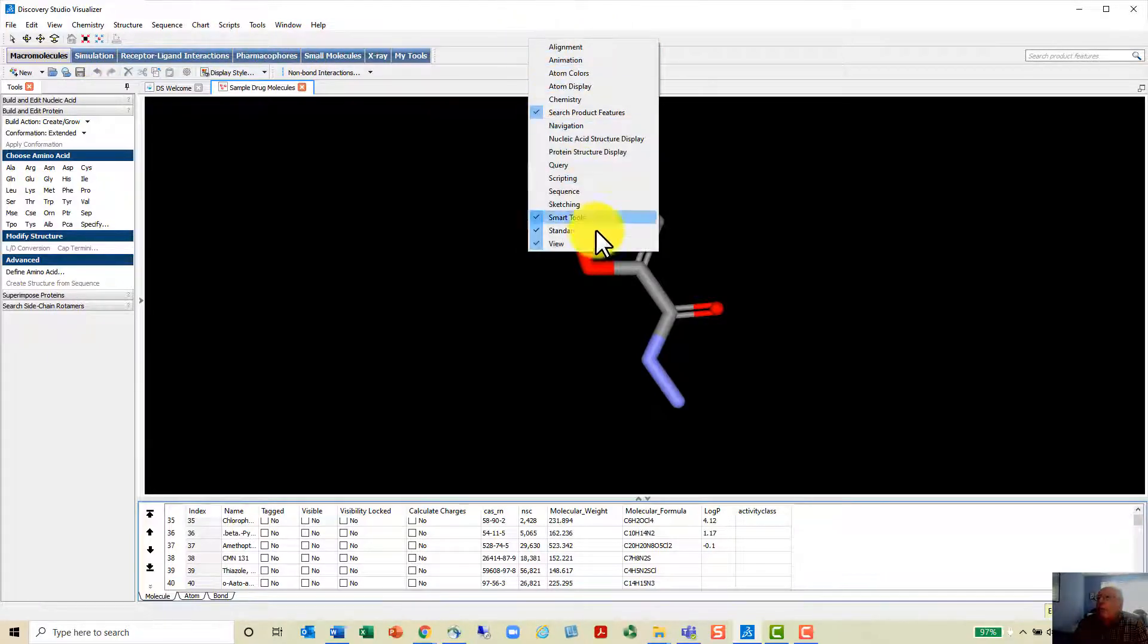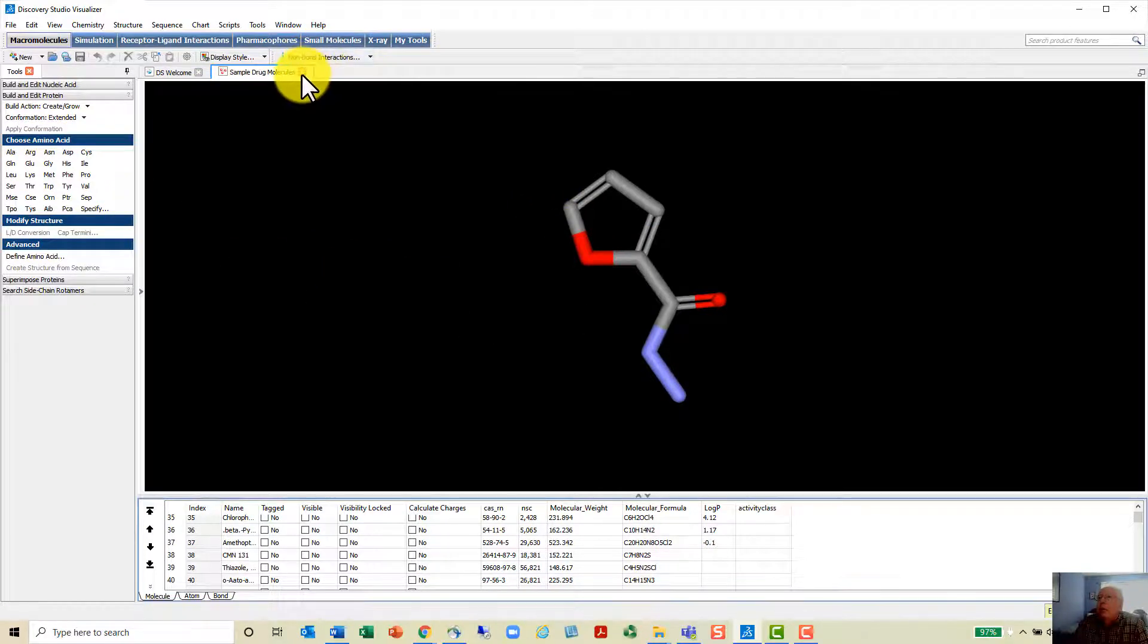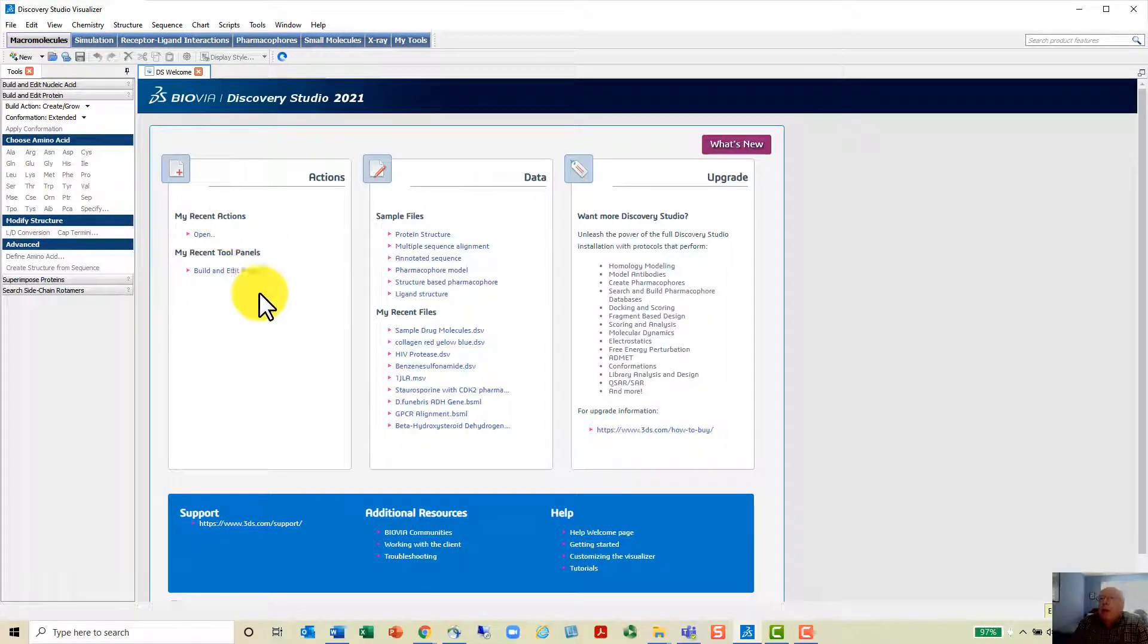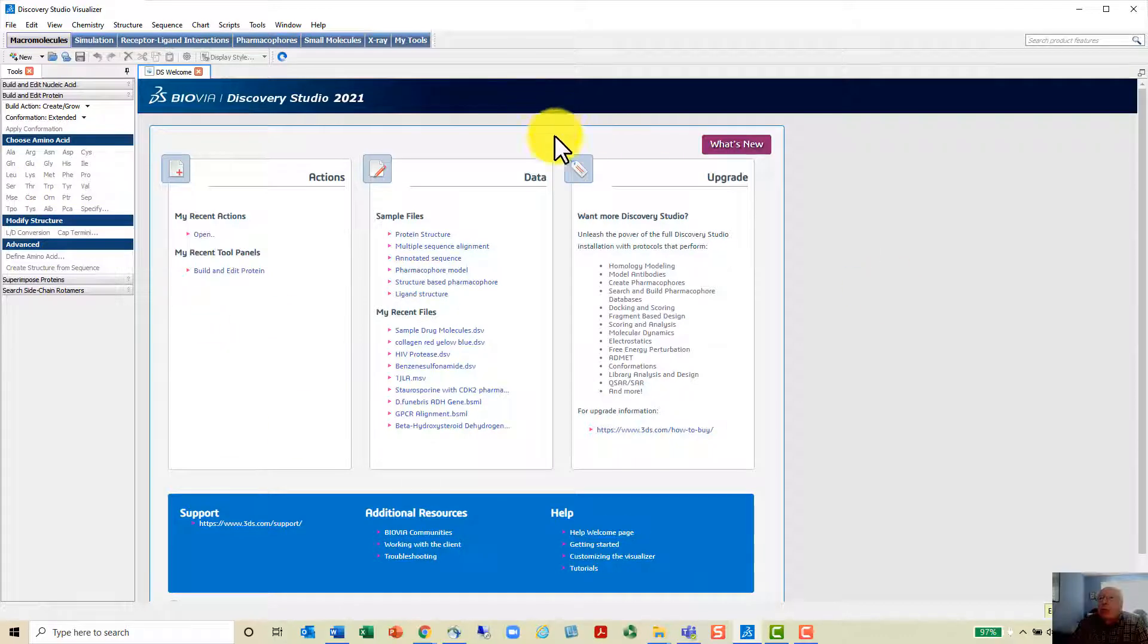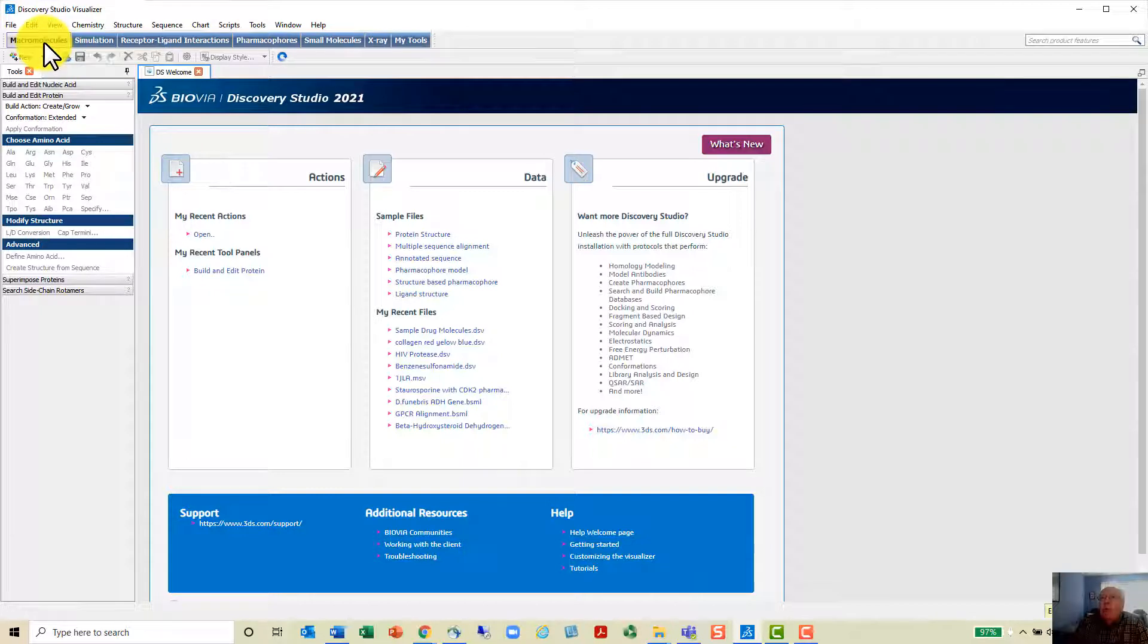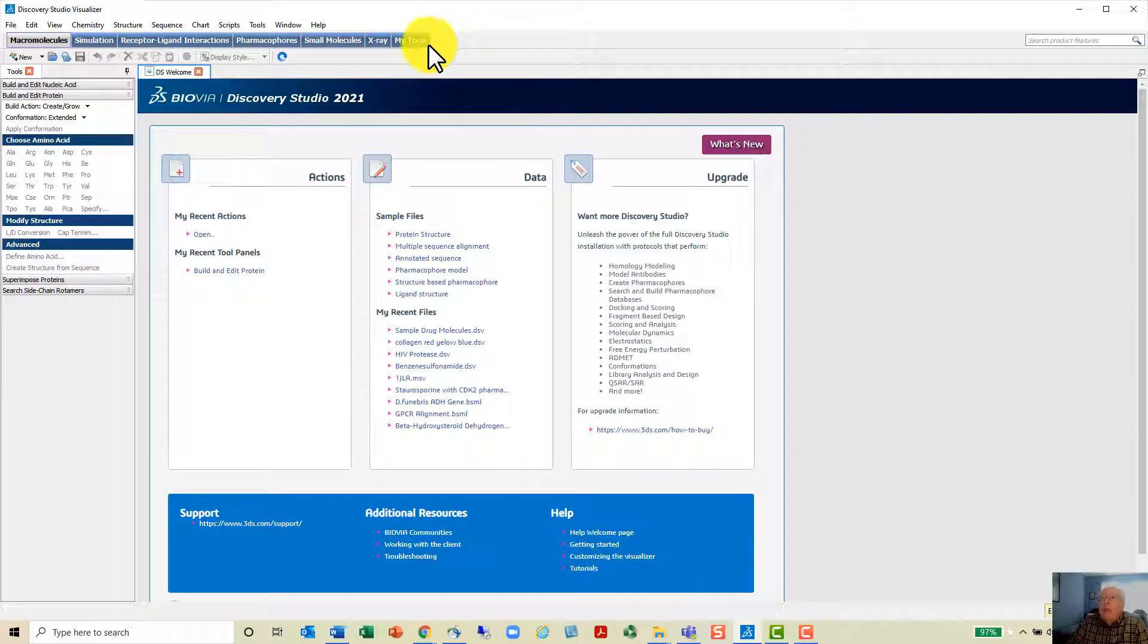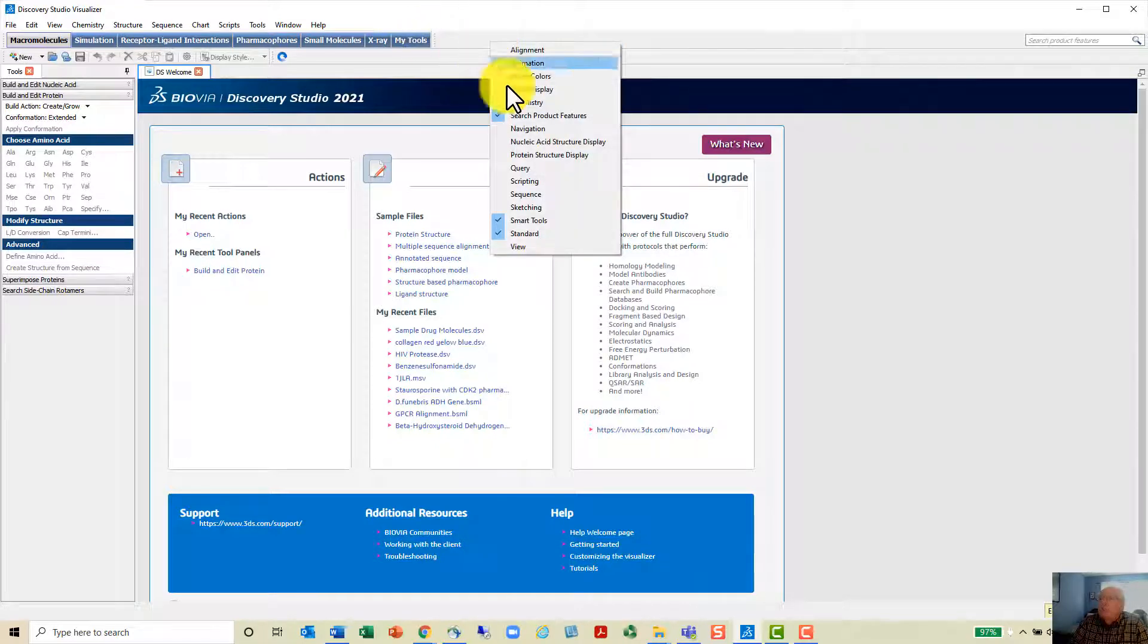Then you get the software and this is what you initially wind up with. I'll go back and show you how to do this. Here's the basic information you'll get. We're going to study macromolecules, simulation, receptor, ligand interactions, and various other things.